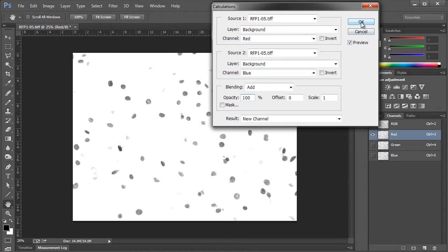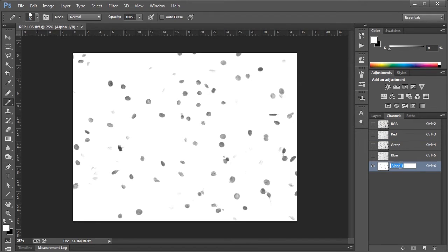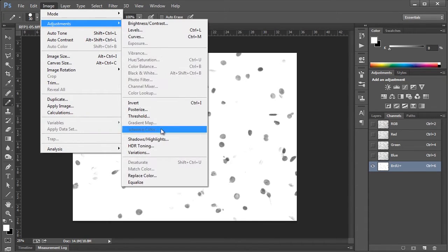So let's go ahead and click OK. I'm happy with how this looks for now, and I'll show you why. This creates a new channel, which we can call BrdU positive, just to keep ourselves organized. And what we want to do is convert this to a completely black and white image, which is to say no gray at all. So for that we use the Threshold command, which is under Image Adjustments.